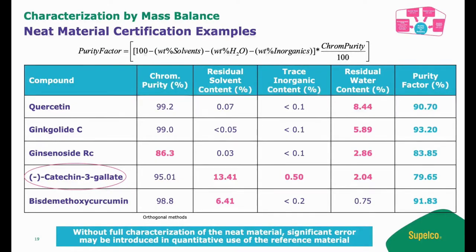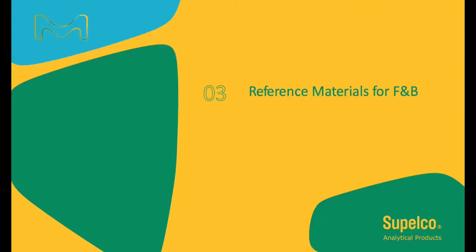For laboratories preparing their own in-house working standards, significant error may be introduced in quantitative uses of the reference material without full characterization of the neat material. So this concludes the technical part of my presentation. Let's now look at the reference materials for food and beverage testing.